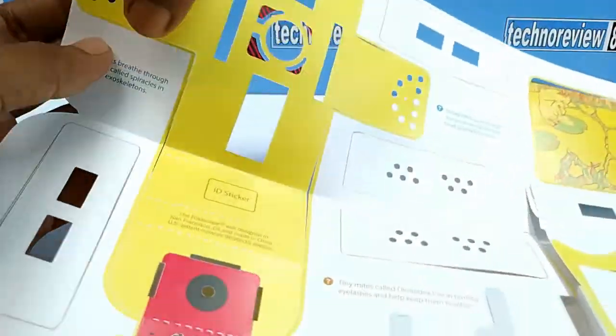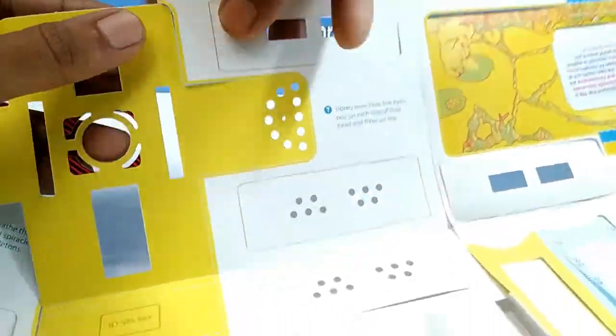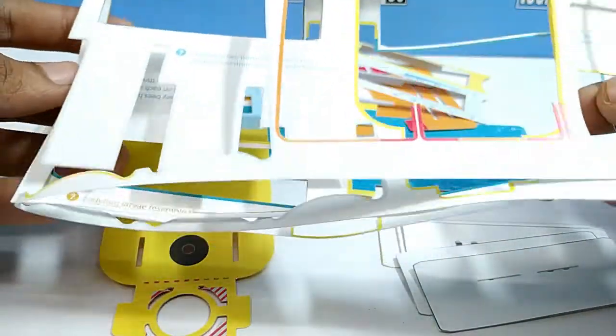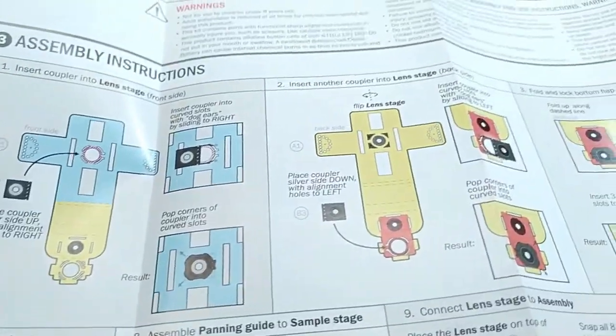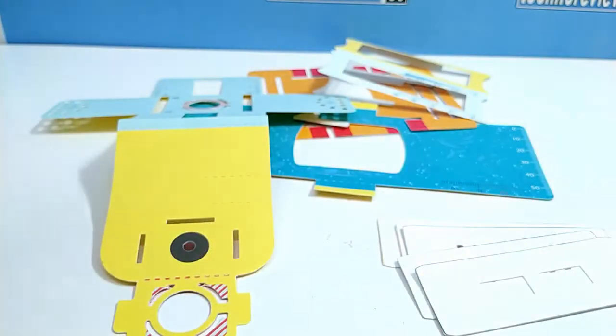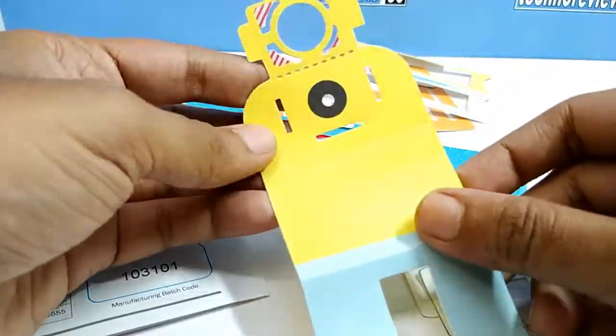I have to detach all parts, so I am assembling it quickly. It is like a puzzle, but I think you can do it easily.